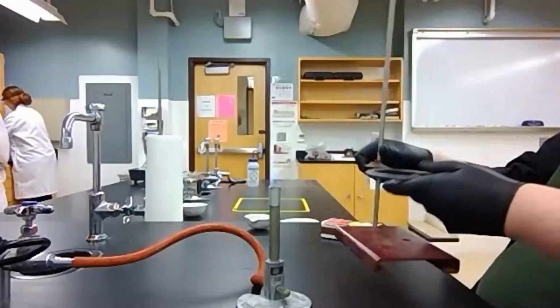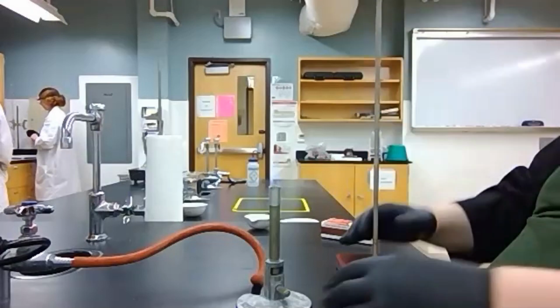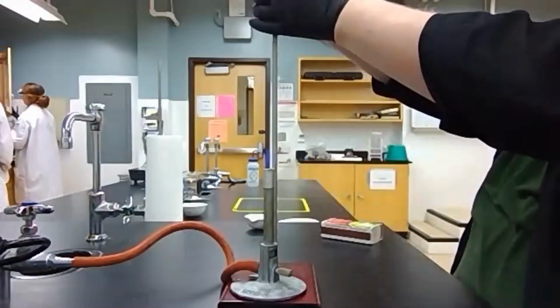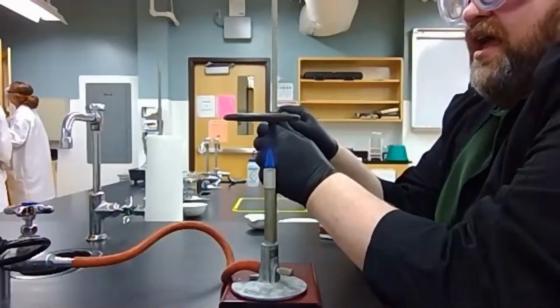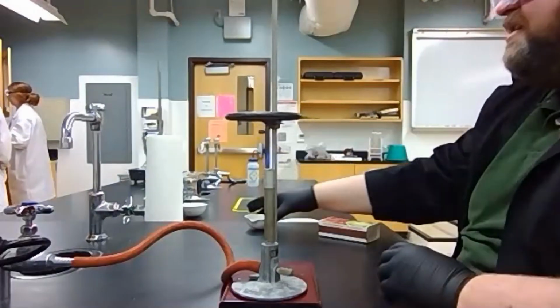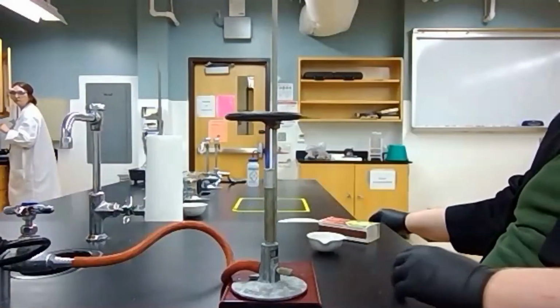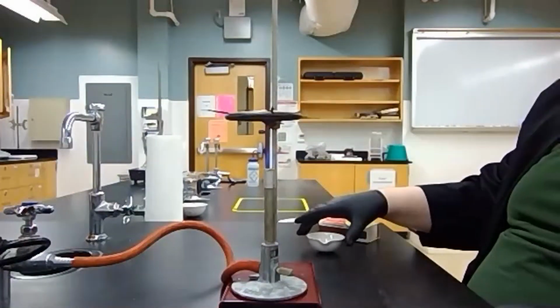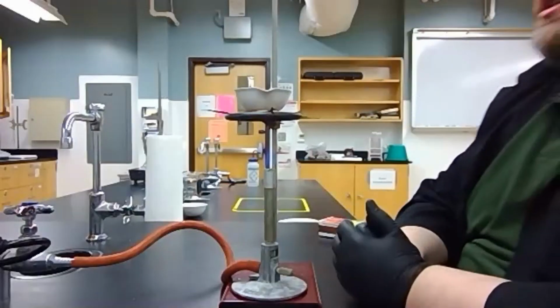I'm going to take my ring stand and iron ring. I'm going to raise my iron ring all the way to the top. I'm going to put my fire on the ring stand, and then I'm going to lower my iron ring so that the outer blue cone is just a little bit inside of it. Okay? Now, my evaporating dish won't set on that iron ring, so we're going to use the same fix that we used earlier. We're going to put a clay triangle on here, and then we are going to gently set our evaporating dish on top of that.